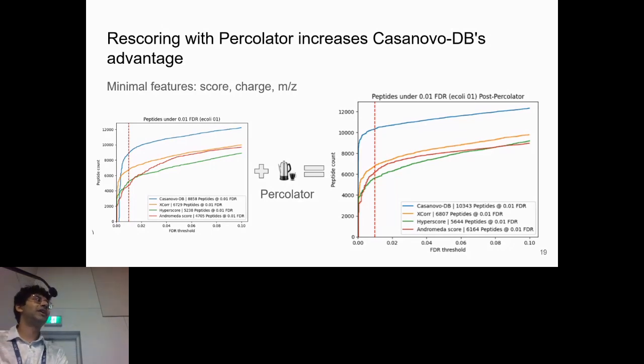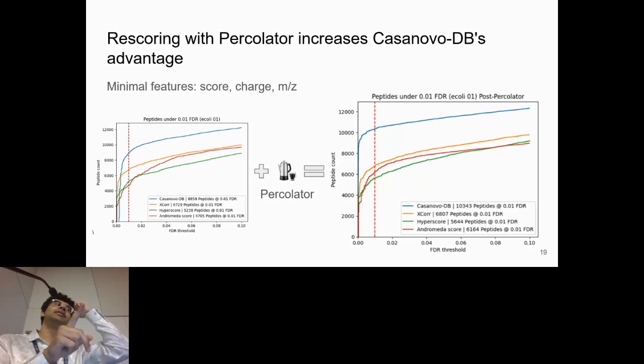Based on my quite rough experiments before I made my way over here, I Ctrl+C, Ctrl+V'd a huge MGF and just ran it through. Projecting, for 1 million PSMs, I would assume it would take less than 30 minutes or so. I wish I could pull it up right now. I should have put it on the slides. But I believe it's in like 0.0001 seconds per spectrum or per spectrum-peptide pair.